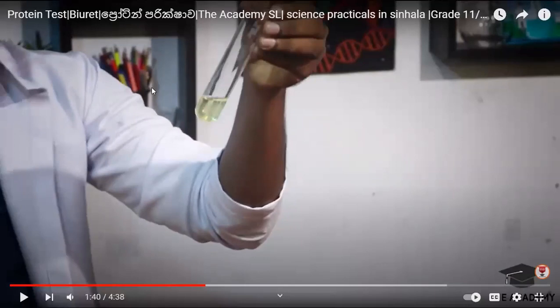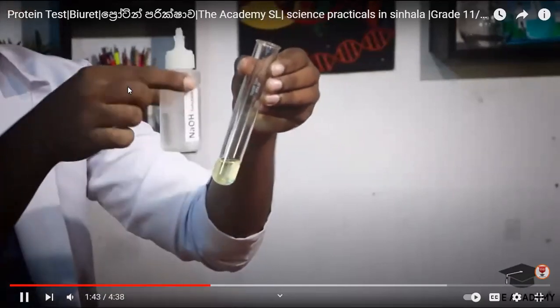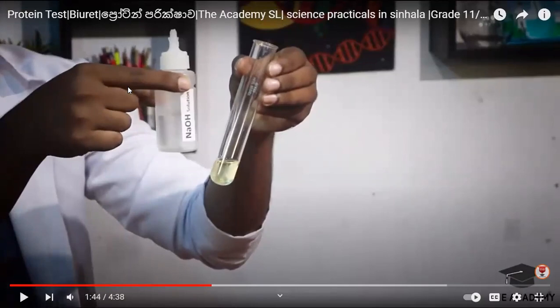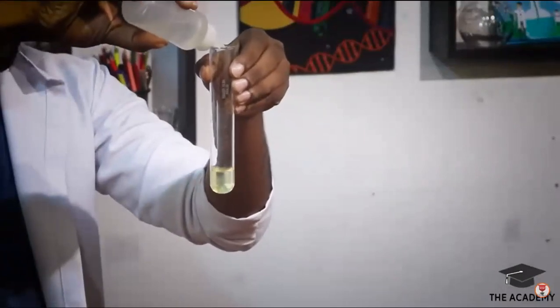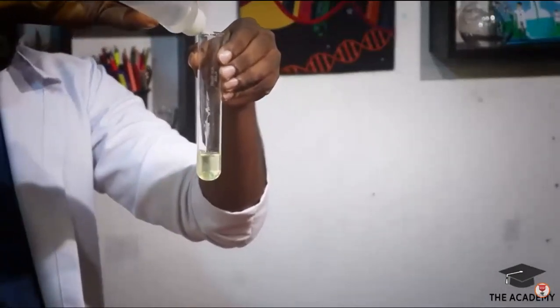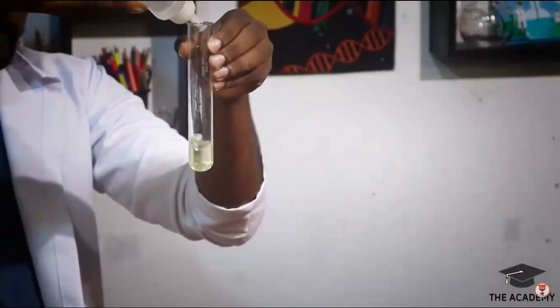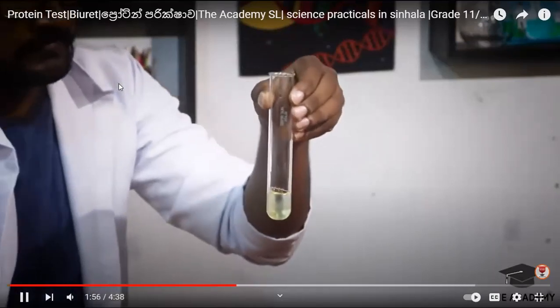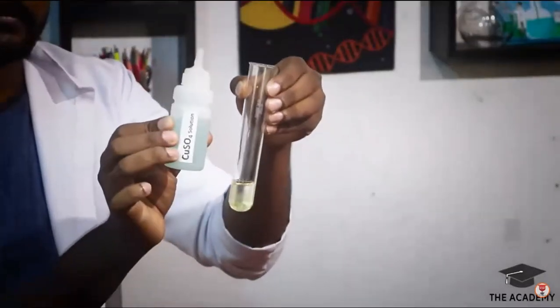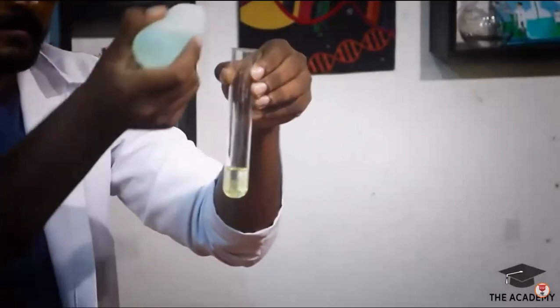It is egg white. What is it? Egg white. That is sodium hydroxide. So first you are adding sodium hydroxide. Now copper sulfate solution, few drops.